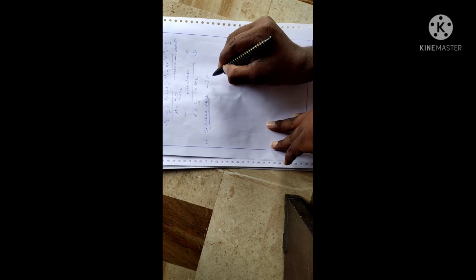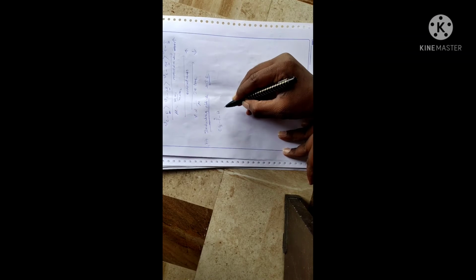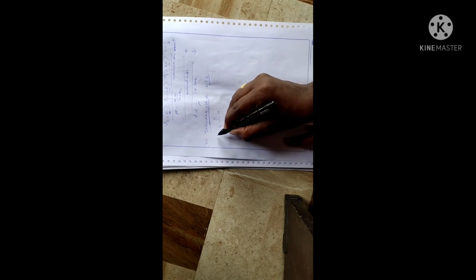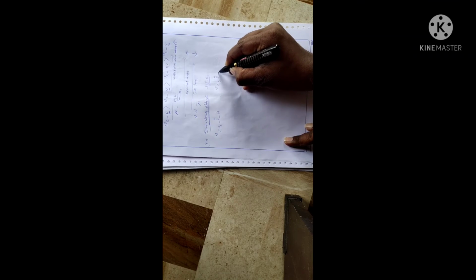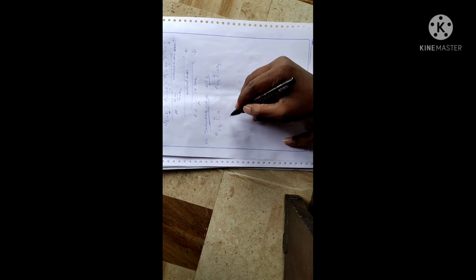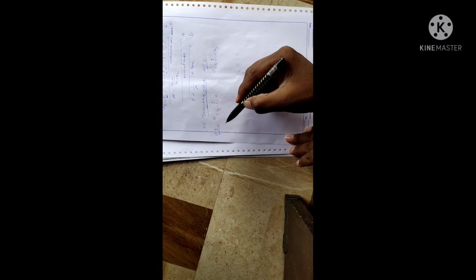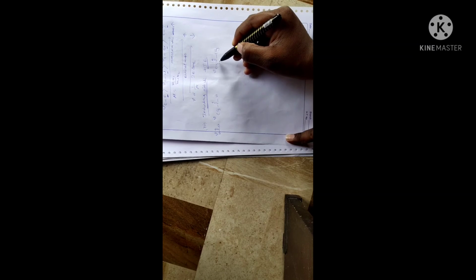On the carbonyl functional groups, we see CH3COH, and the frequency of this compared to the frequency of CH3COCH3, and before that the frequency of HC=O H. We see three compounds: formaldehyde, acetaldehyde, and acetone.